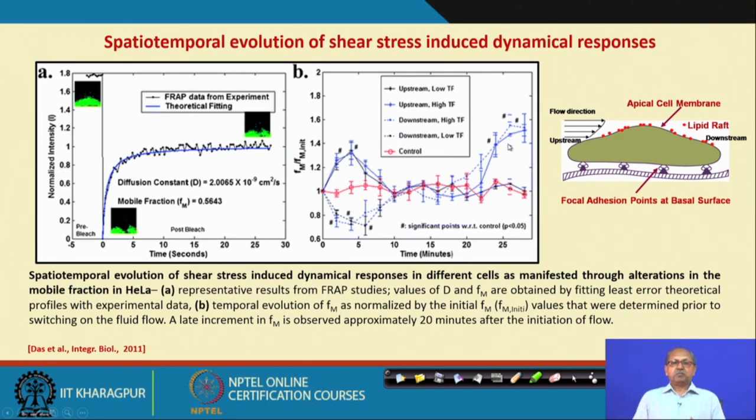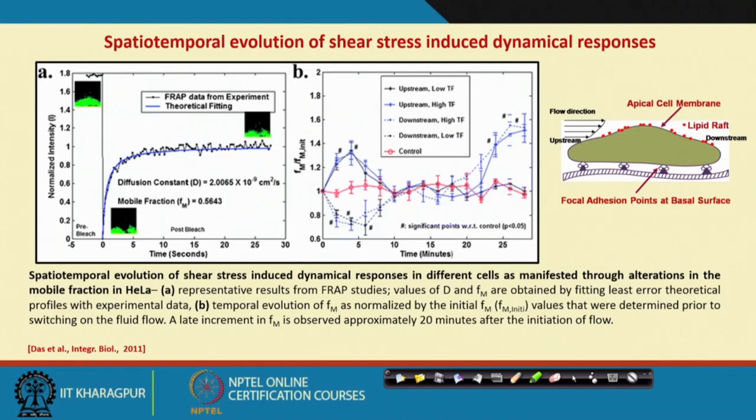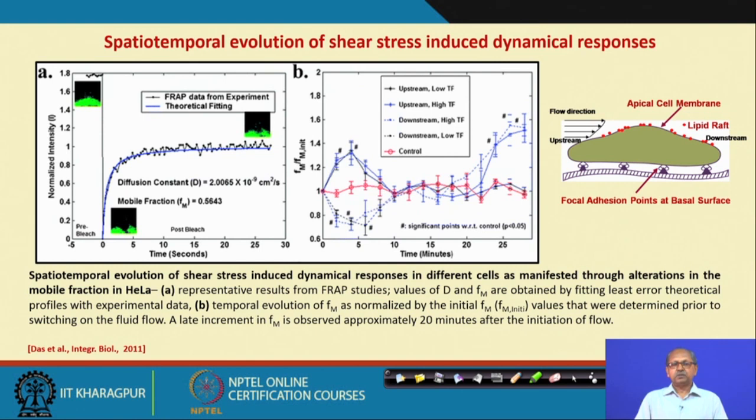Means by this setup we can assess how fluid flow is affecting the membrane fluidity, which will be measured by FRAP analysis.